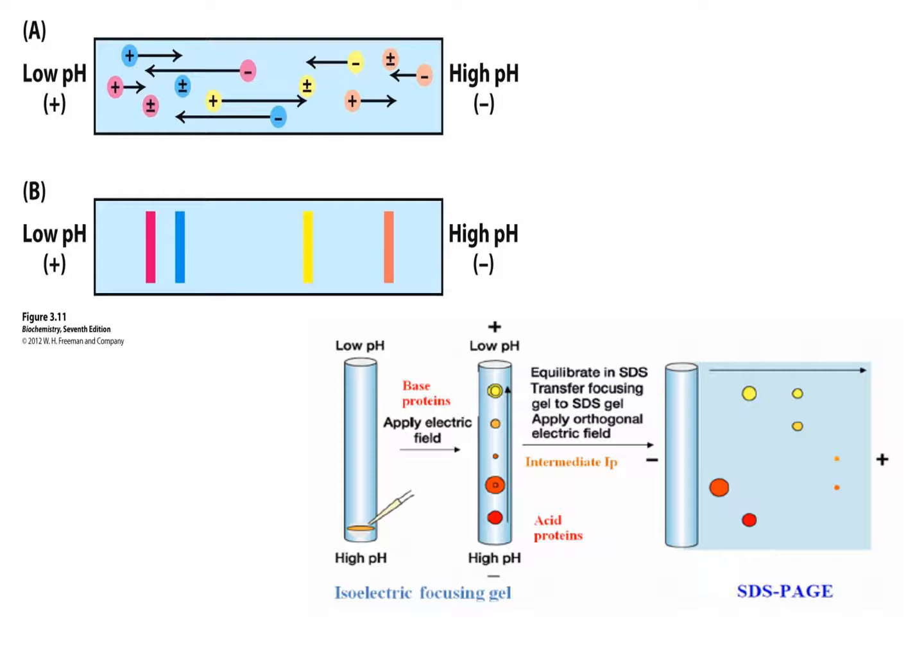So isoelectric focusing is you apply a sample to the strips or the gel, and you have low pH or high pH on either side, and you apply electrical current, and proteins will move until the movement between the two poles is equal, and that's said to be their pI. They will now focus right there. Focus means they don't move. And so here in this cartoon, there's 4 different proteins in this mix, and we separate them that way.